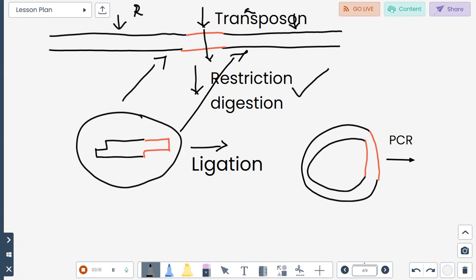These fragments you can subject to self-ligation using a ligase enzyme. Either you can clone it into a vector and use it, or you can self-ligate it and directly use it as a template. Generally, what we can do is self-ligate it and directly use it without ligating with a vector.